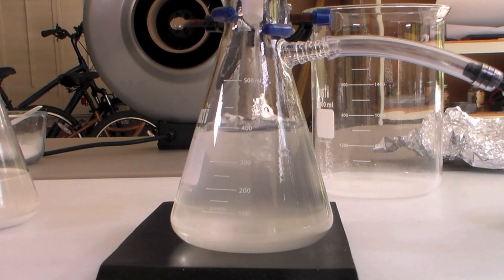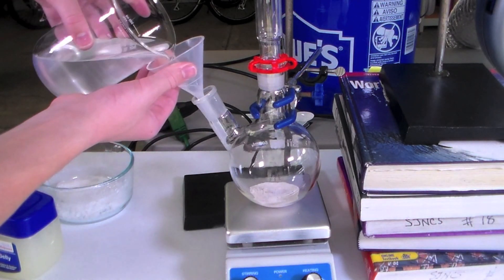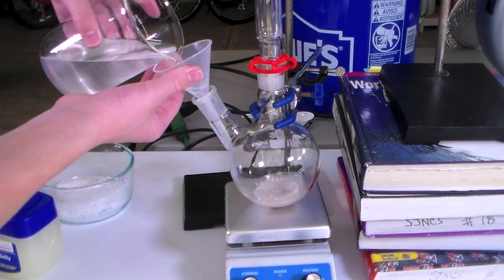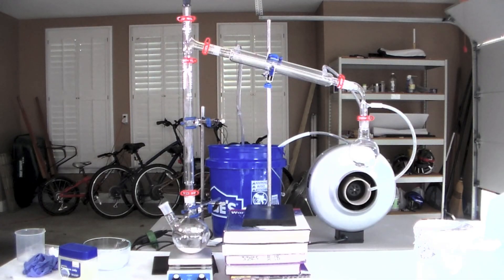How you proceed from here will depend on how pure you want your ethanol to be. It will still contain a small amount of acetone, so if you want to remove this you can fractionally distill it and discard the acetone distillate that comes over at 56 degrees Celsius.